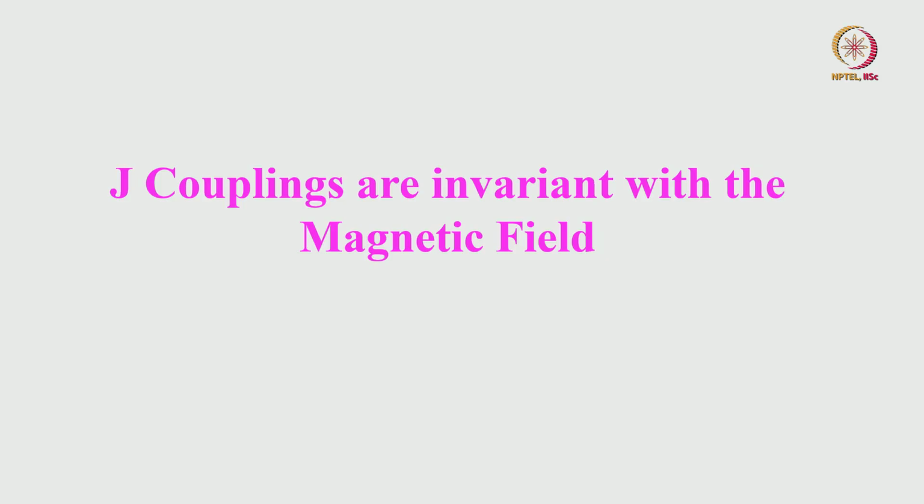Okay, so with this, more or less, I have covered a lot about the scalar coupling information I gave you. Today in fact we discussed a lot about varieties of multiplicity patterns and took a number of realistic examples. Looking at a complex multiplicity pattern, how do you put a nomenclature on each of these multiplicities? What is a doublet, triplet, doublet of triplets, triplet of quartets, all possible examples we took. And afterwards I showed the strength of the J coupling.